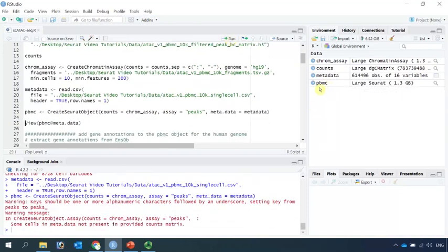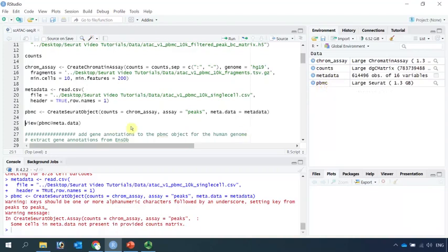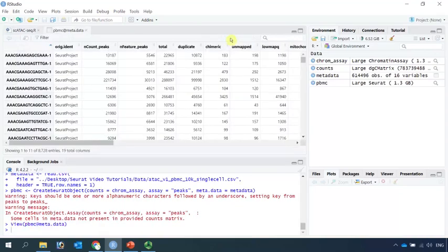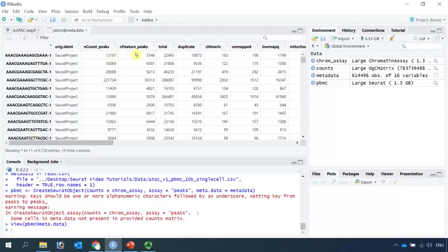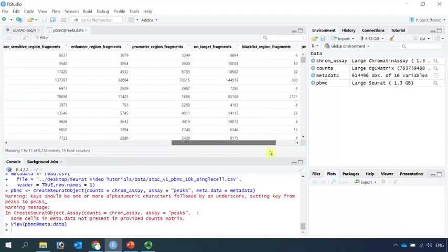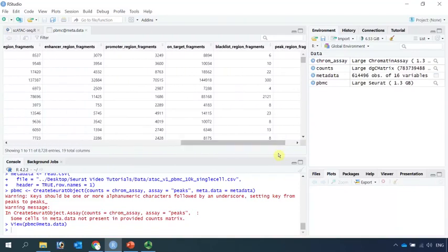You can see we have PBMC Seurat object now. Let's have a look at the metadata of PBMC Seurat object. You can see we have the barcode. There are counts for the peaks and features for the peaks.